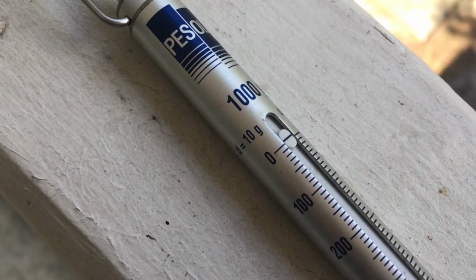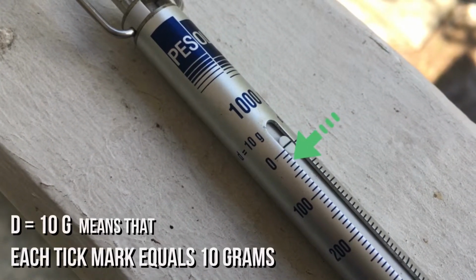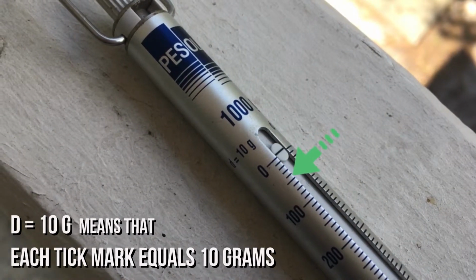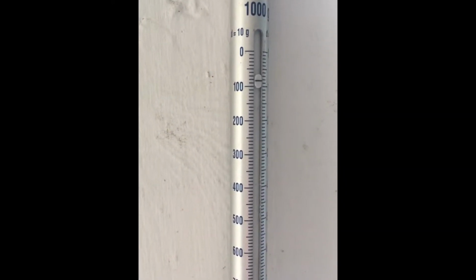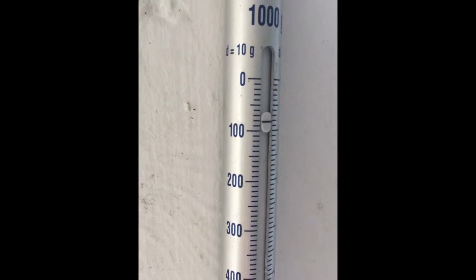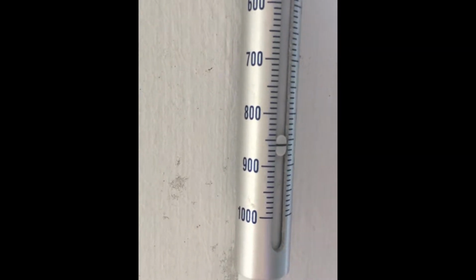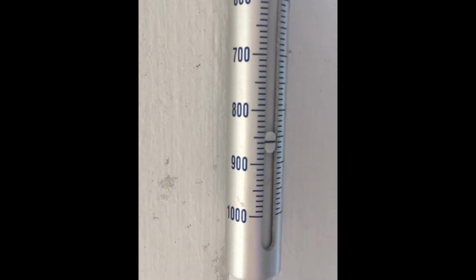On the top of the spring scale, you will see D equals 10 grams in small letters. That is there to remind you that on the left-hand side of the scale, each tick mark is equal to an additional 10 grams. For example, we can see here that the fine line in the center of the oval is lined up with 80 grams. In this measurement, you can see that it equals approximately 860 grams. The fine line in the center of the oval is lined up with 860, one tick mark below 850.